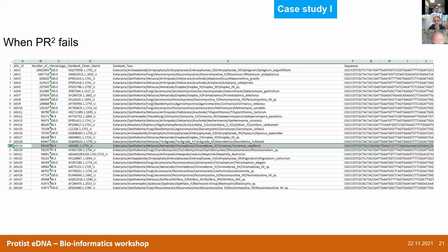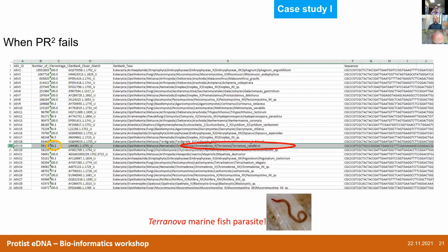The closest match from PR2 is Terranova caballeroi, which is a nematode — a marine fish parasite closely related to Anisakis. You may have heard of Anisakis — when you buy fish to make sushi and cut the salmon or tuna, sometimes you find small living worms trying to escape. Those are Anisakis, and Terranova is related to those. You would not expect that in a peat bog — there are no big fish in the peat bog. So let's use BLAST.